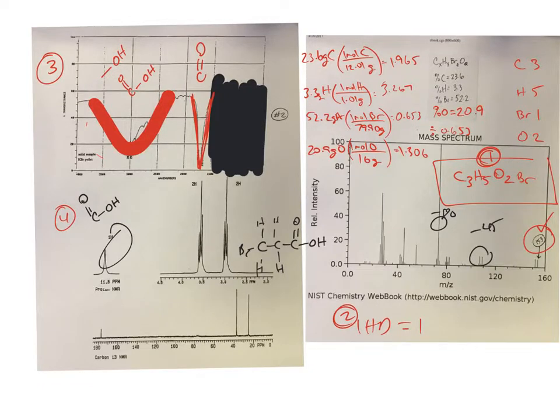Okay, back in, oh no, that was the view of the test. Okay, here we go. So now again, here we just started playing with some spectra and doing some spectral analysis. Here we looked, and I have these numbered. So follow my numbering. That is totally the strategy I would take when trying to do a structural determination, okay?